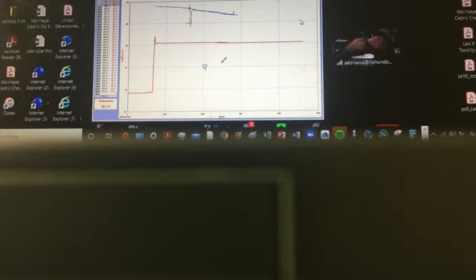Water took up that heat coming from that metal, and it's going to heat up a little bit. It's going to increase its temperature. The metal, however, its temperature decreased from the initial hot temperature to a lower temperature. Both are going to wind up having the same final temperature. The initial temperature of the water, the cold water, is cold. The final temperature is the final temperature of that process. The initial temperature of the metal added is hot. It's going to wind up having the same final temperature as the water and the metal together.